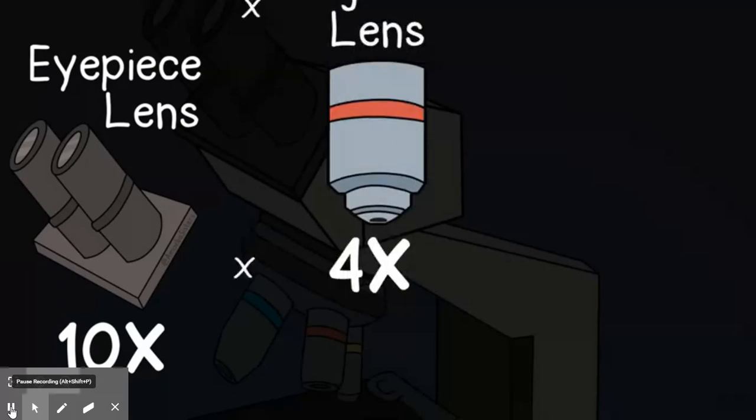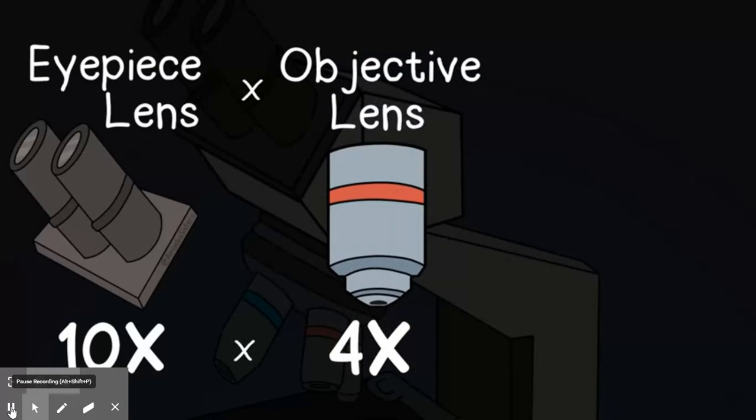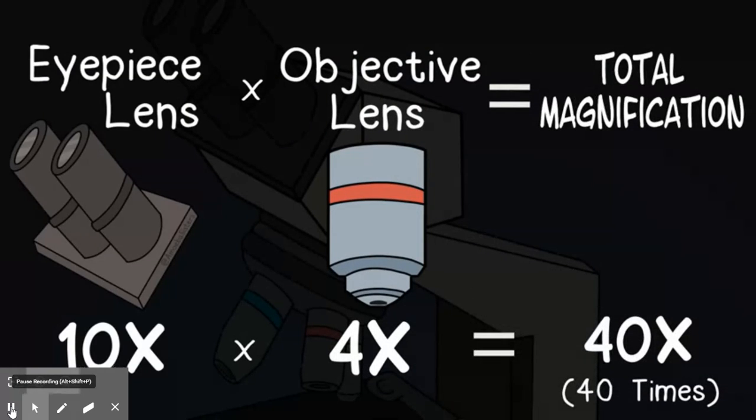So let's eyepiece lens magnification level so that my total magnification is 40 times.